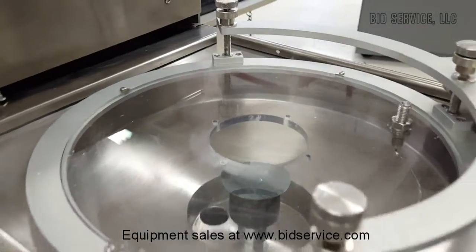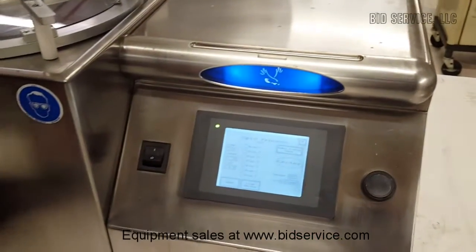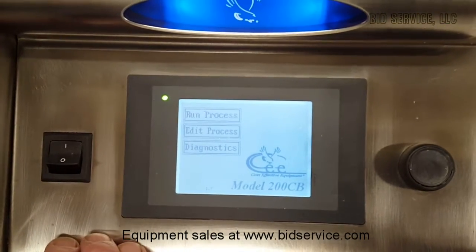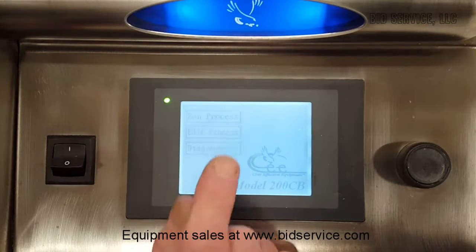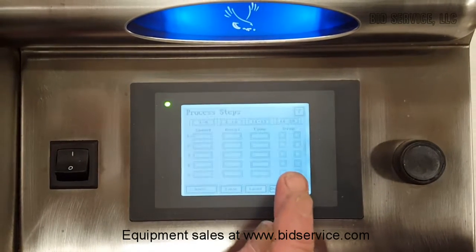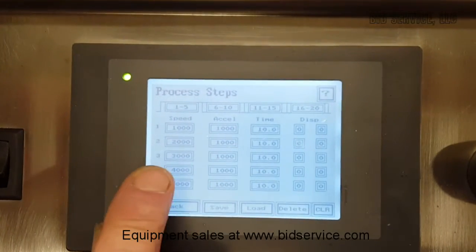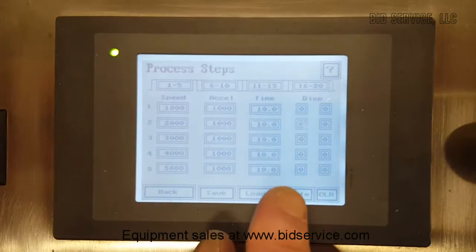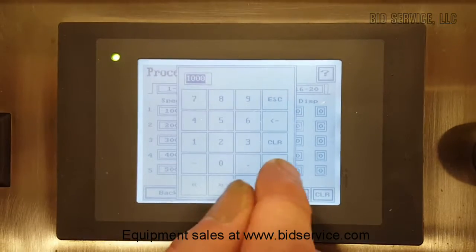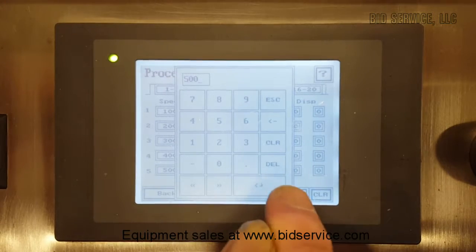And there we go, that's the full range. We're back to the controller. I wanted to show you the edit process. You can edit either bake or spin. This allows you to go into the programs and change your speeds, your acceleration, your time — up to 20 different steps. It's very easy to do. You just go into each one of these parameters. You can clear it and then enter a different figure if you wanted.